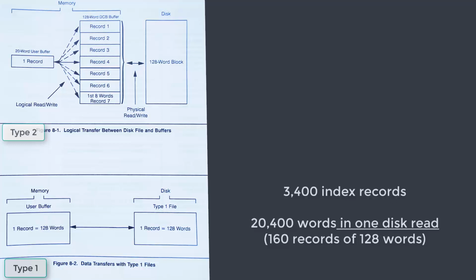For example, this is used when a data block, typically 60 results, was transferred from the so-called display files and had to be entered into the work registers. All pointers to the 60 result records could thus be found for the requisition in one disk lookup, and then linked directly to all result records. This index function could be in a separate program, as previously mentioned, a program with saved resources.